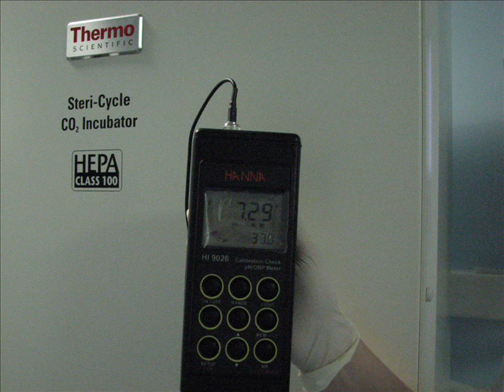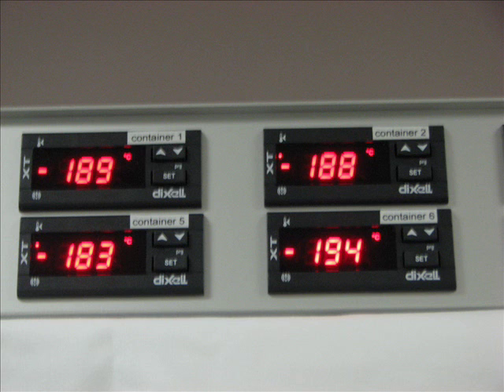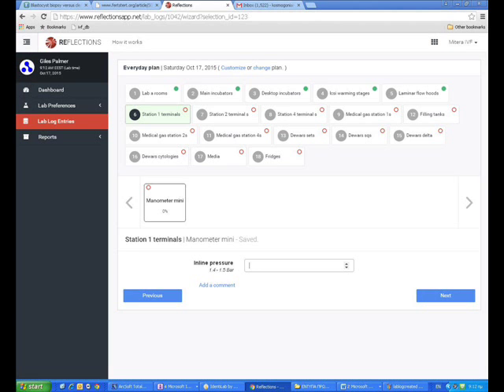It's accessible from anywhere with an internet connected device, so you can even check this when you're off site. There's instant insights, so data is stored electronically. I've done away with a vast amount of paperwork that I had, and I'm quite pleased that I can store all my information of the instruments online, and here's a screenshot just to show it.